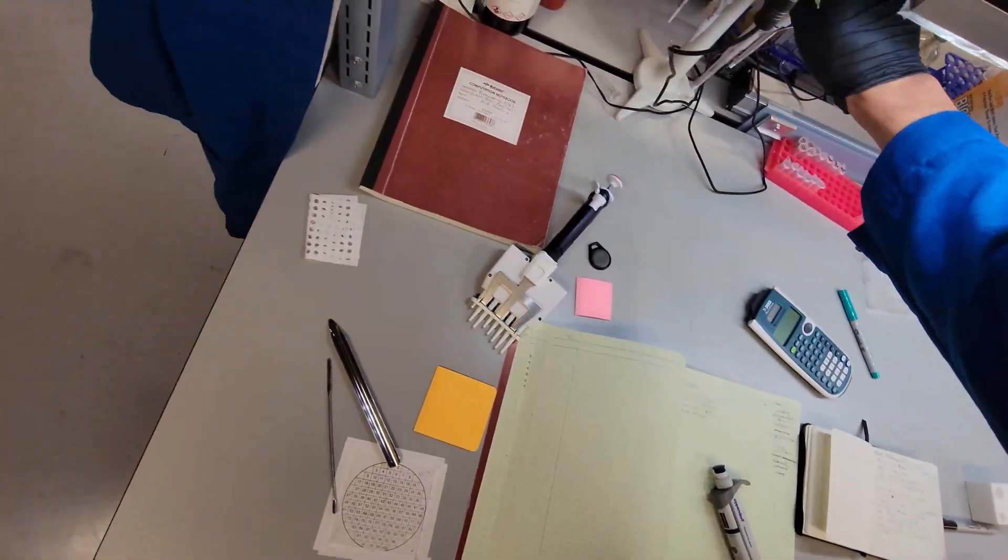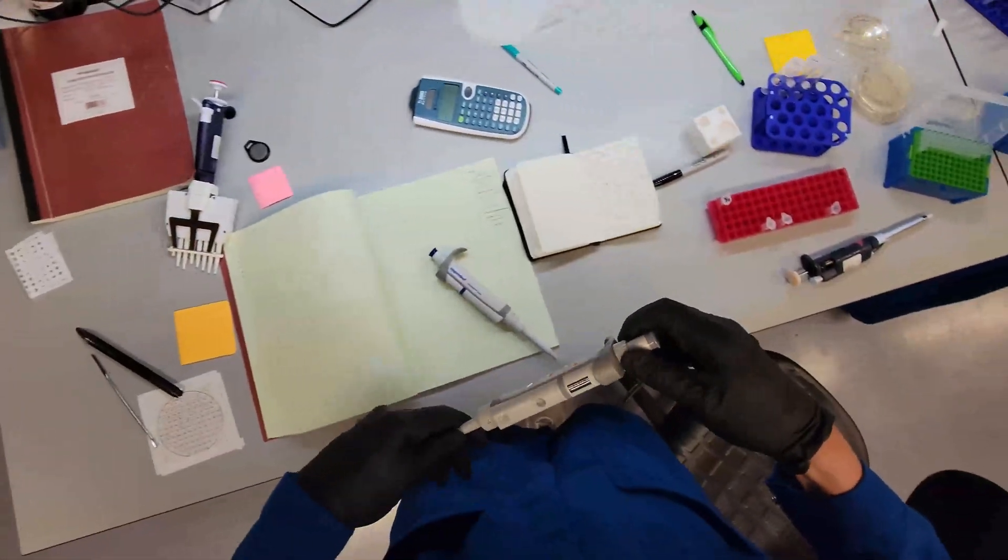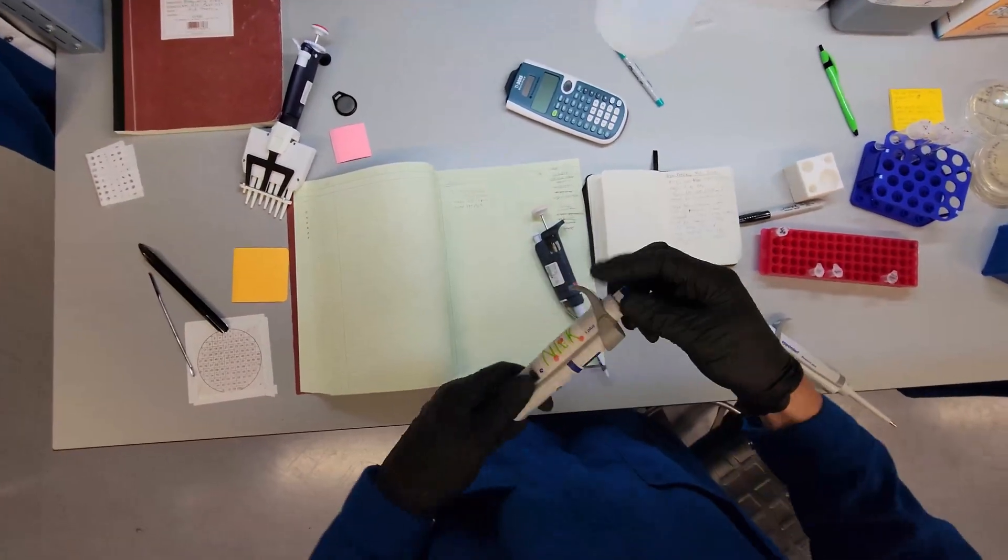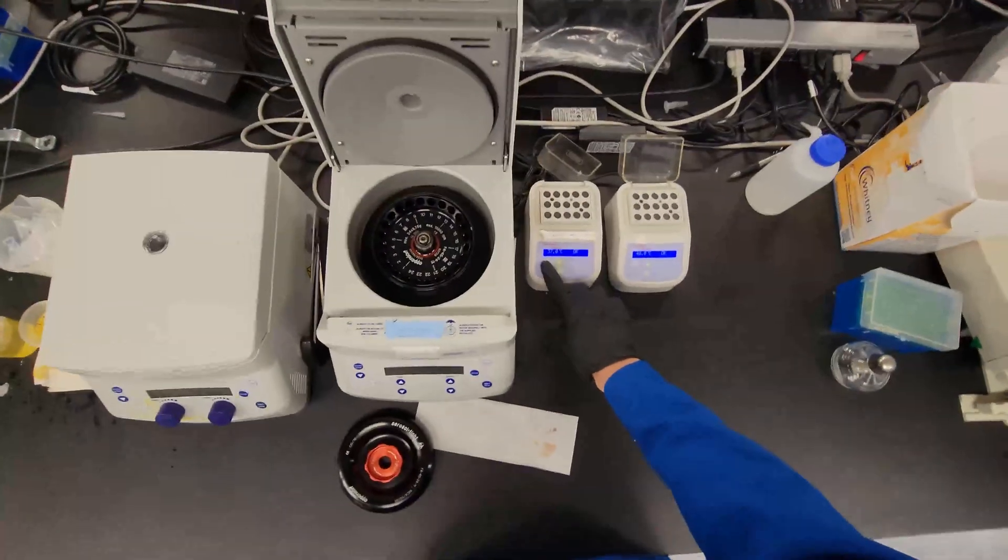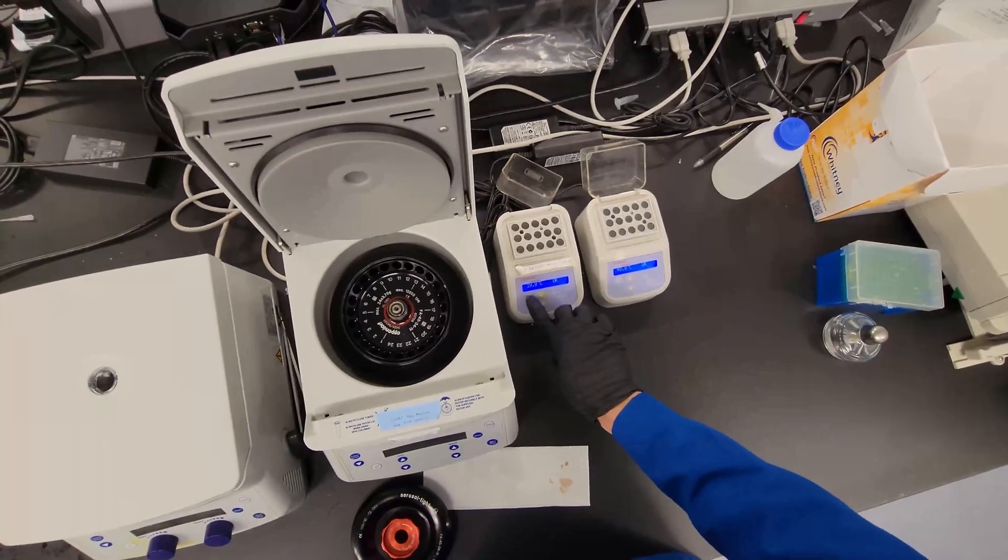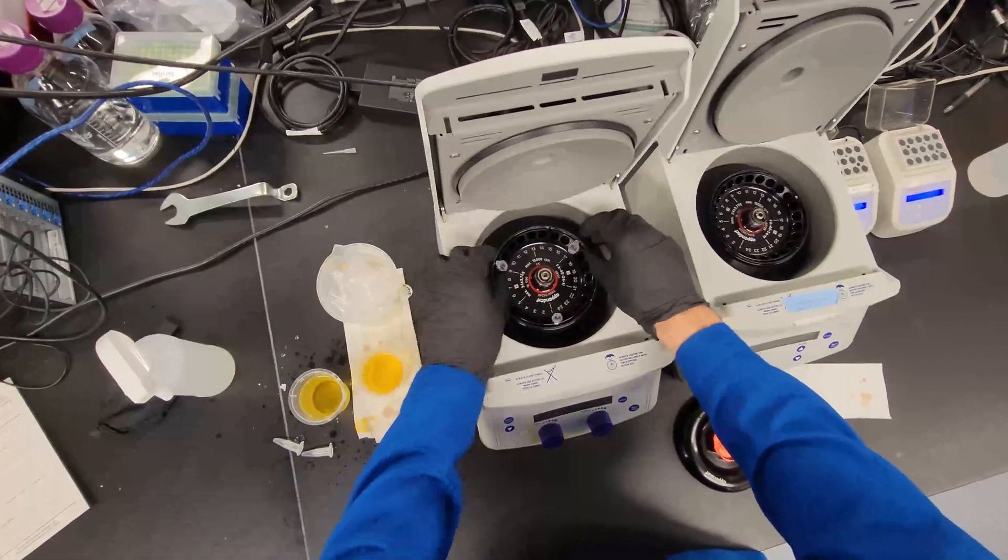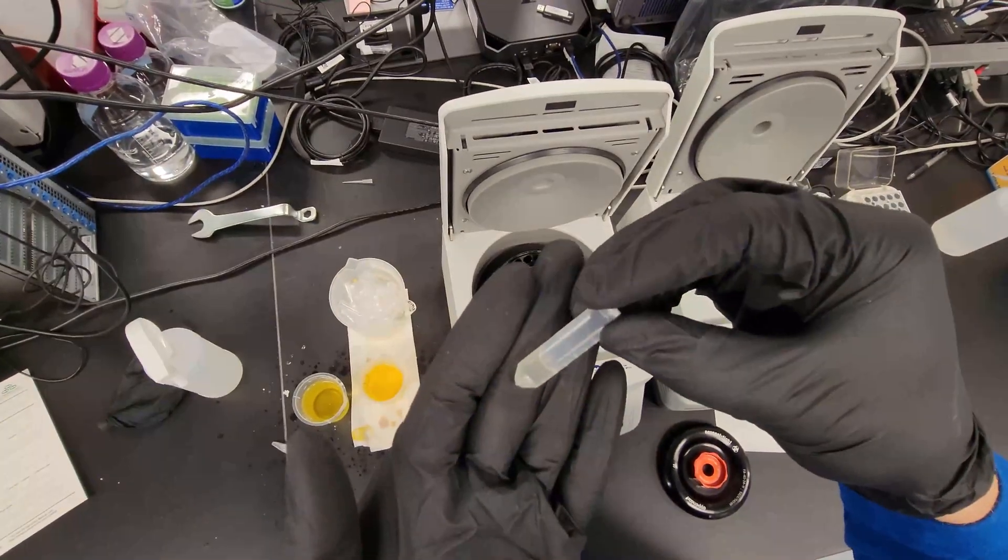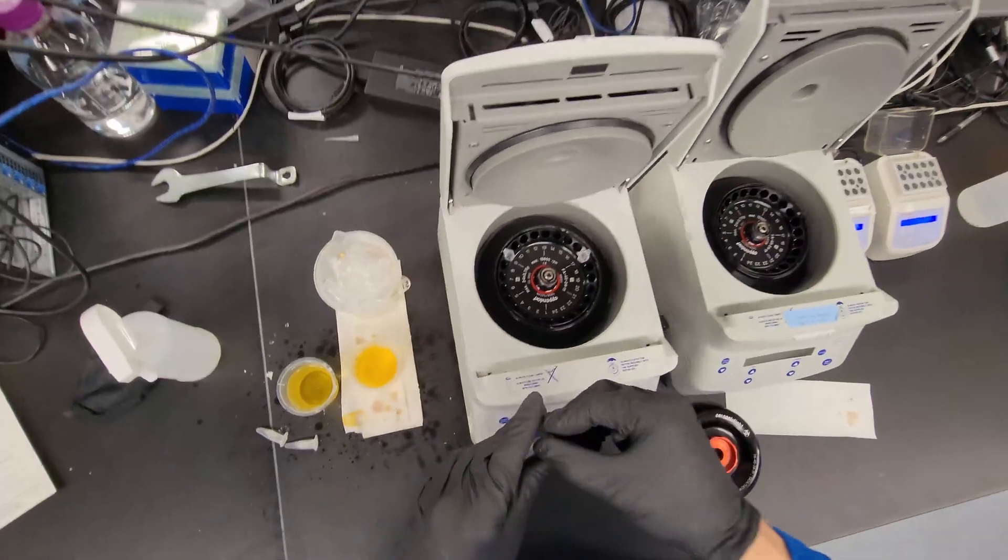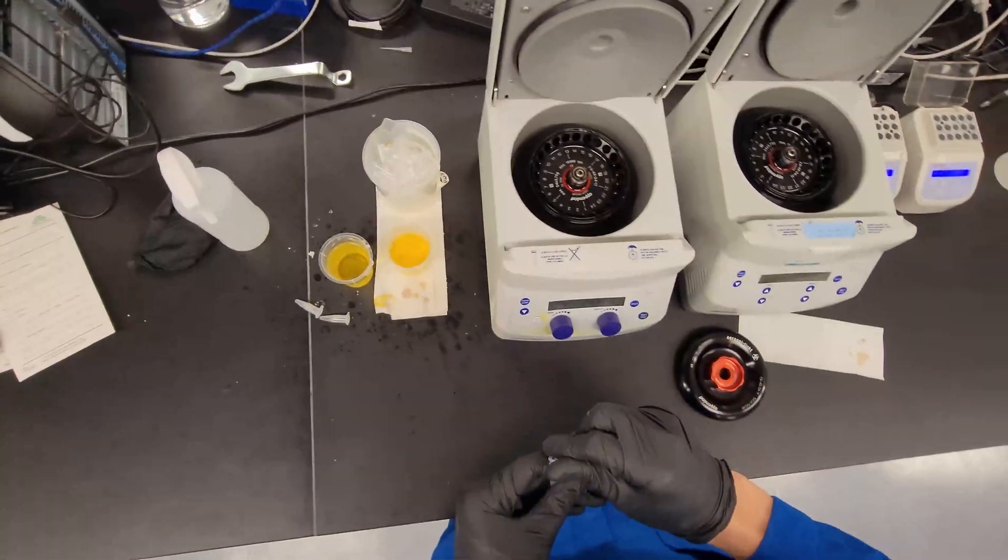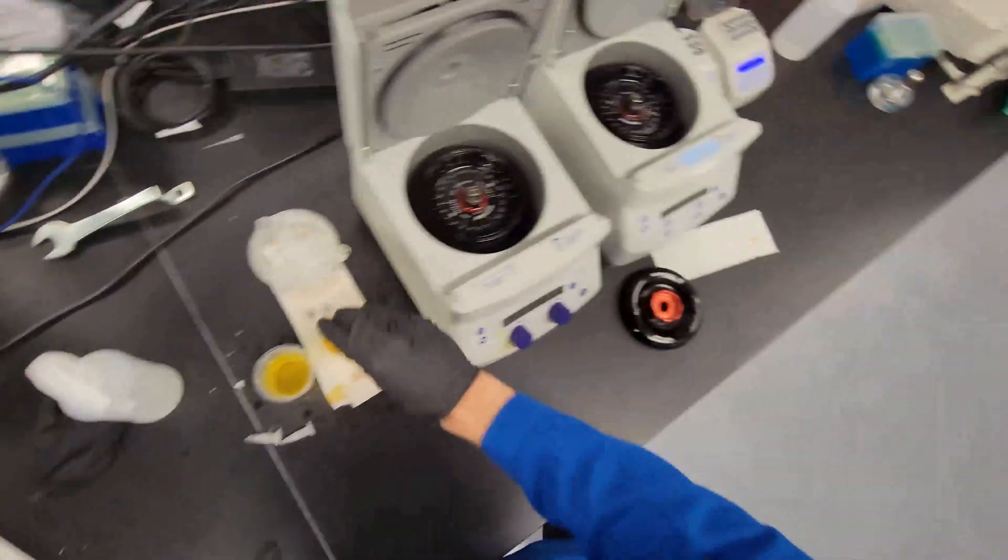So we'll get our pipettes ready. So we want 8 microliters of our SS-DNA, 300 microliters of our transformation buffer, and we'll want to make sure that the heat block is ready for us too. We want this at 39. And I'm adding some water just to assist in the heat transfer, because the heat transfer to the cells is really important. Okay, so we've got a nice pellet of cells. Let's dump out the supernatant. 2000G for 4 minutes is a good speed to not damage the cells.